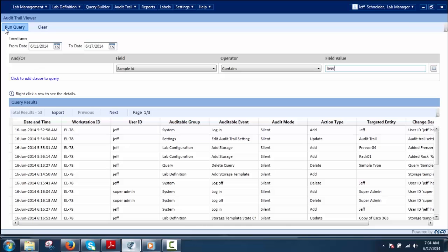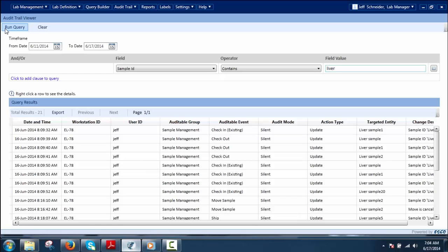Define the query for audit trail sorting, then click Run Query to display the results of the defined time frame and query clause. Click Export to export the sorted audit trails to an MS Excel file. Click Clear to refresh the query definition.